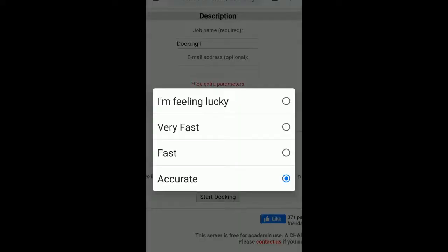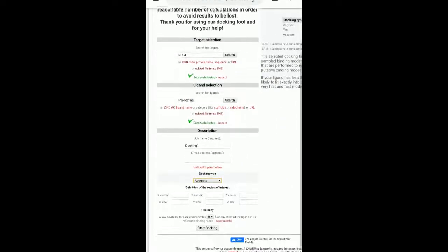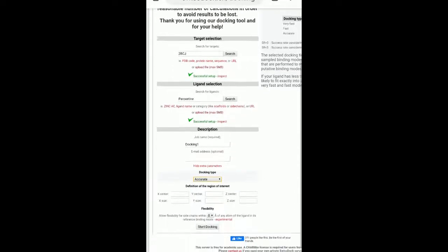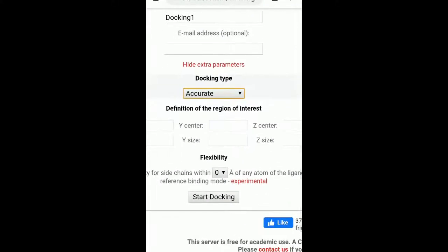What I recommend to you is go for the accurate one. So this is how you perform the docking. In this case, I am not incorporating any XYZ axis — I am just keeping it as blind docking. And now because we have incorporated the target and the ligand, I will click on 'Start Docking'.